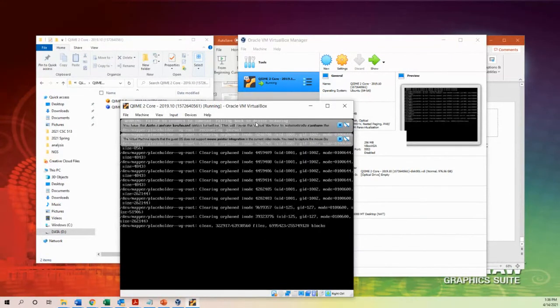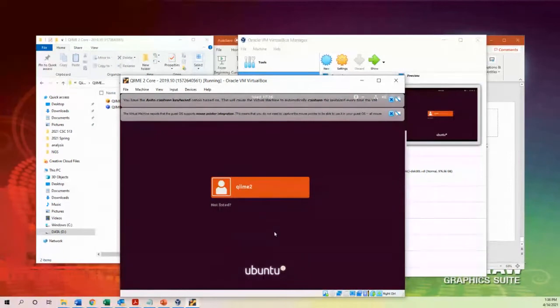Did you click this? Yes, Professor. Good. Now we wait for the program to be initiated. And now, once you reach this stage, raise your hand so that I know.